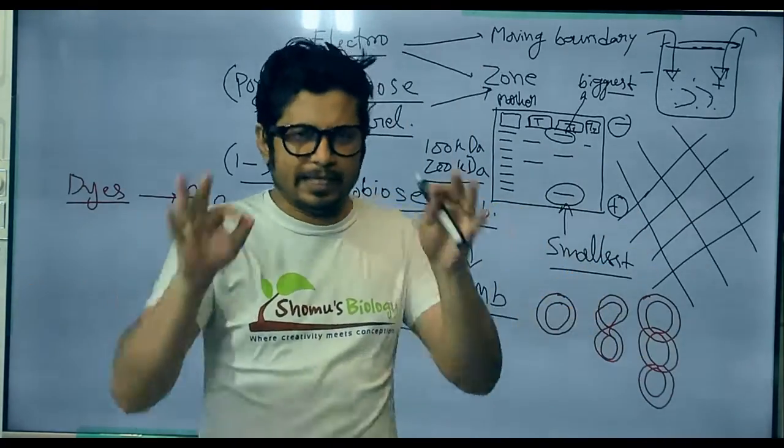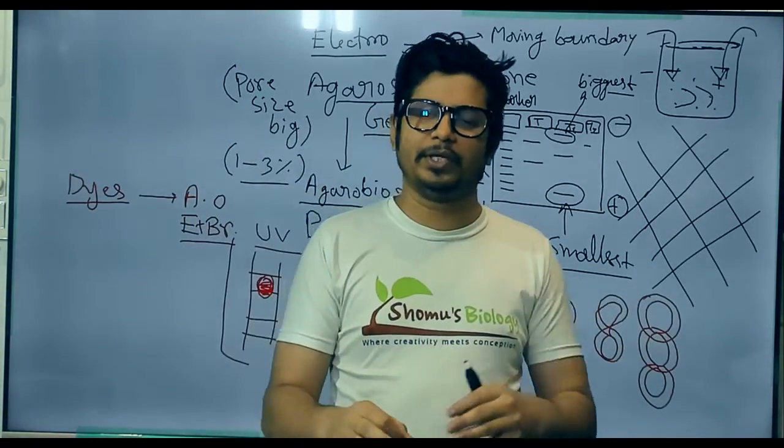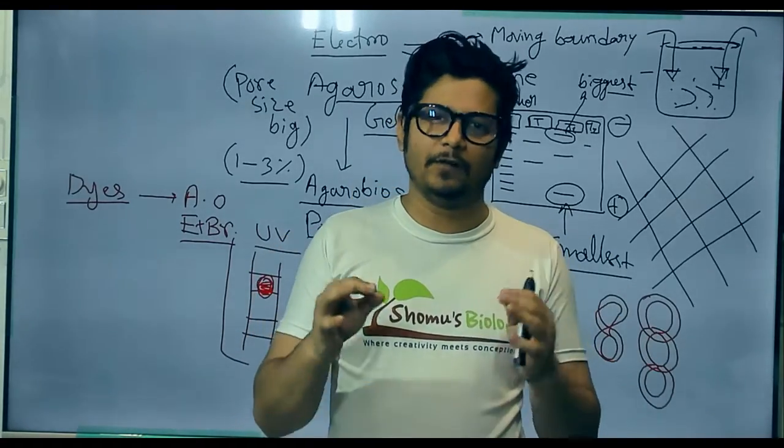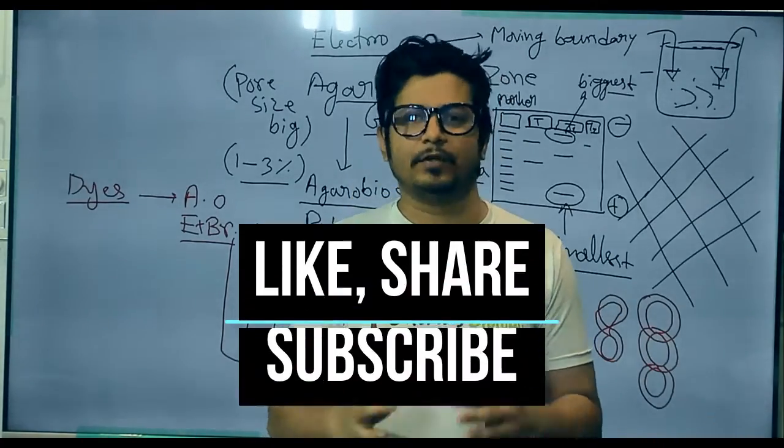That's almost everything that you need to know to answer most of the questions from this topic, that is gel electrophoresis of DNA. Agarose gel electrophoresis of DNA.